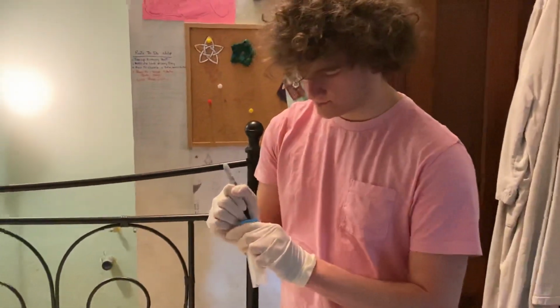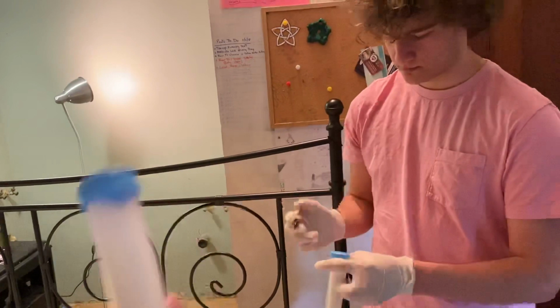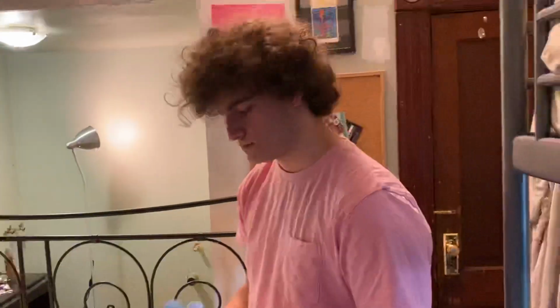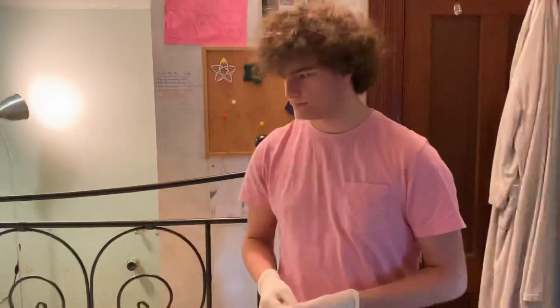And what they're going to do with this information, they're going to take these tubes. This is number 1 on top of the mattress cover, and that's number 2. They're going to take these and they're going to dissolve them in a laboratory setting, and find out how many micrograms of lead dust there are, actual micrograms. And because we measured a square foot, we're going to have a reading of X number of micrograms per square foot. Anything else you want to add there?